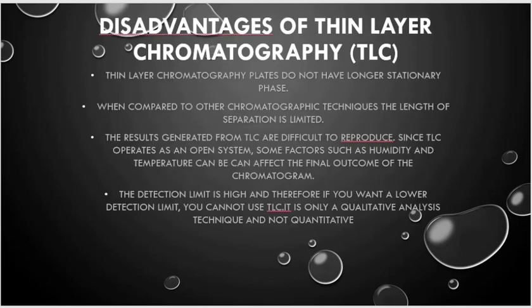Now we have the disadvantages of thin layer chromatography. The TLC plate does not have a long-lasting stationary phase, as the stationary phase of the TLC gets damaged within a short interval of time. The second one is that, compared to other chromatographic techniques, the length of separation is limited. The TLC plate has a limited length, and that is the limit for the chromatography.